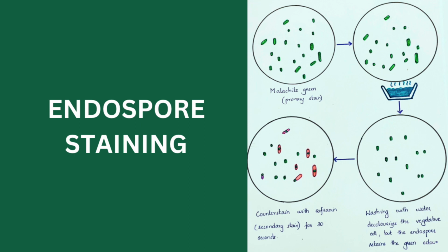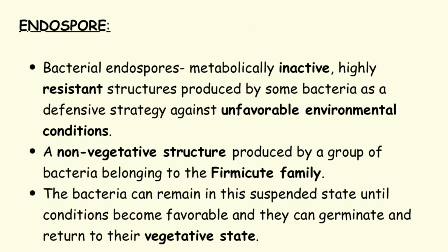Today we will be discussing endospore staining. So first we need to know what endospores are. Bacterial endospores are metabolically inactive, highly resistant structures produced by some bacteria as a defensive strategy against unfavorable environmental conditions.